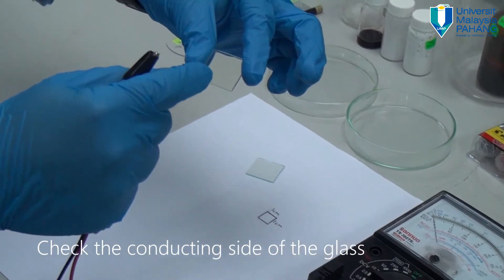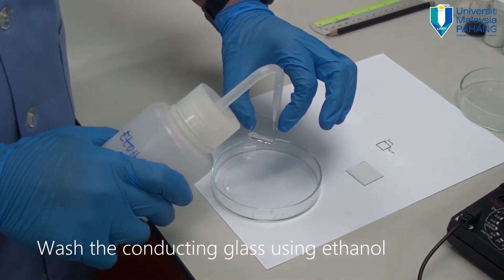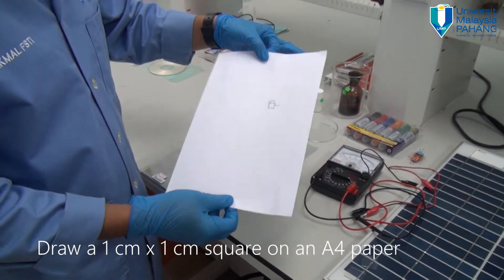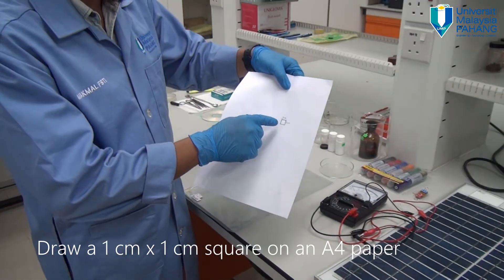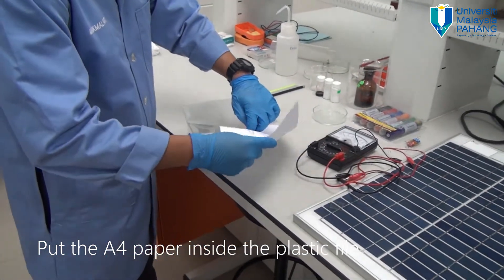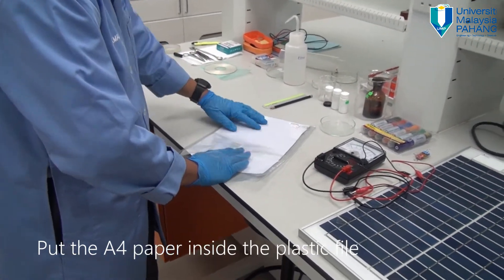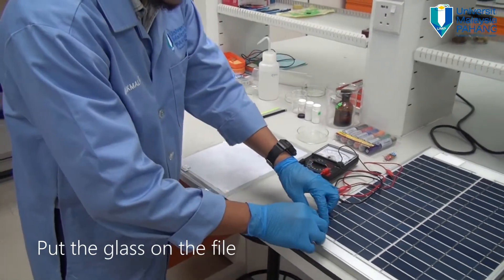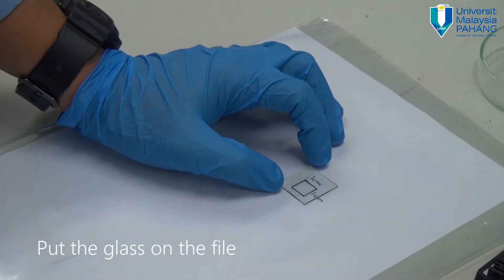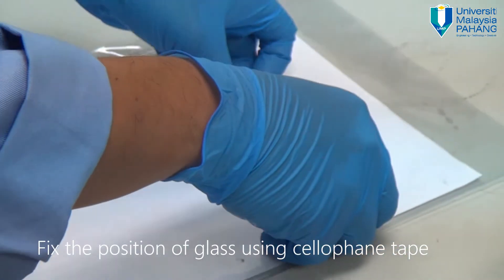Make sure we always work on the conducting side. Simply splash ethanol onto the surface of the conducting side and leave it to dry. You have an A4 paper — draw a square 1cm by 1cm. Put the paper inside a plastic file so the position is fixed. Take your clean conducting glass and place it on top of the plastic, positioned exactly over the square. Fix the position.